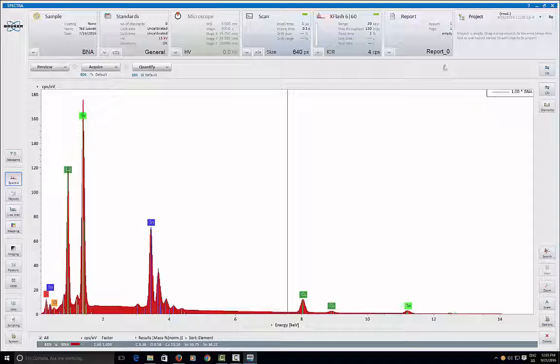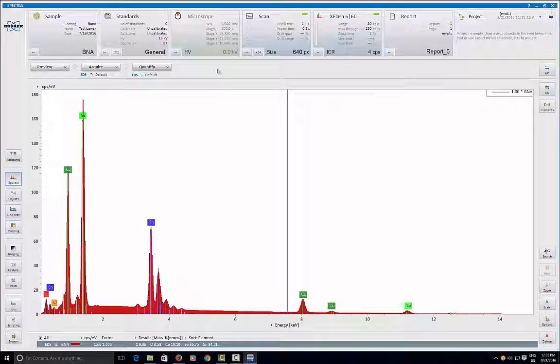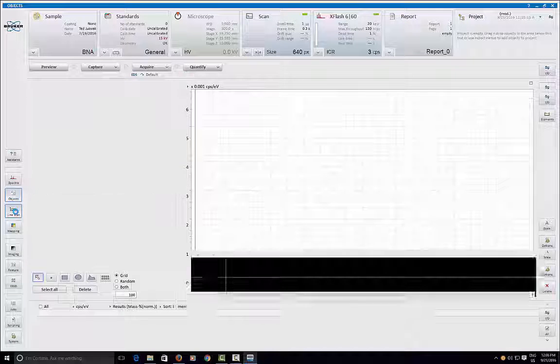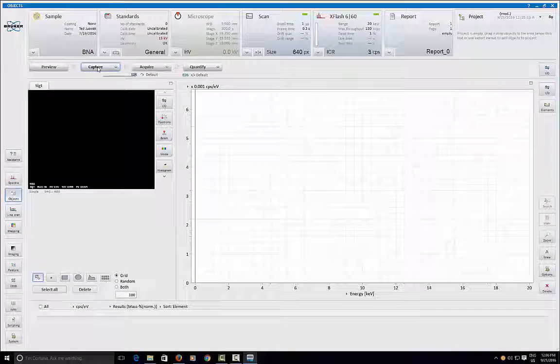Another important thing to note, as we select each object, we only go one level deep on all our menus. This makes the learning curve much quicker. Also, as you select your workspace operations, whether you're doing spectrum, object mode, collecting an image and doing spectral analysis, or doing digital line scan, all your controls are located here, and they're very repetitive. So only the things that are unique for that analysis are up there, and any common controls remain the same.